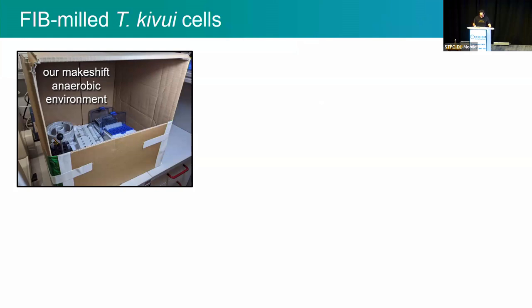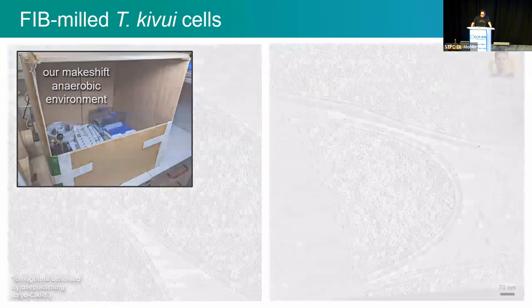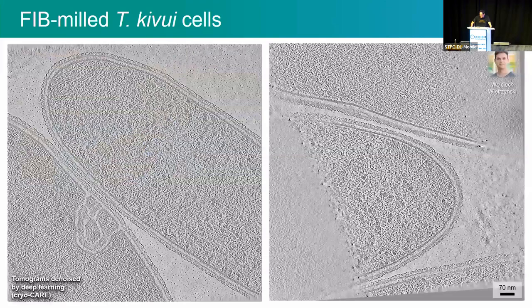So this was almost 2 years ago. Nowadays, our collaborators have a much better environment for doing these experiments. And what we got from these cells, we acquired tilt series. This was the work of my colleague Wojciech Witriński. And this is how our tomograms look like.